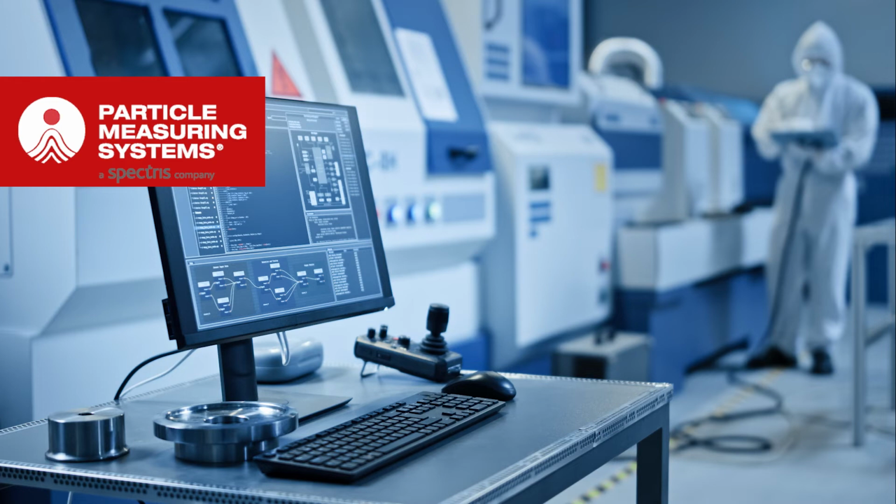Most people know what a risk assessment looks like from a 30,000 foot view. And moreover, it's where we bring our expertise to the front, which is around environmental monitoring systems. Every process within a pharmaceutical application needs a risk assessment of some sort. But when you're looking at pharmaceutical environmental monitoring, it takes on a slightly different vein. And that is because when you start to assess the risk itself, there's a couple of characteristics that you can almost leapfrog over.